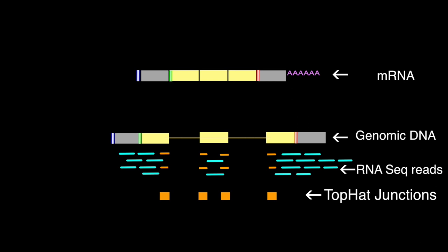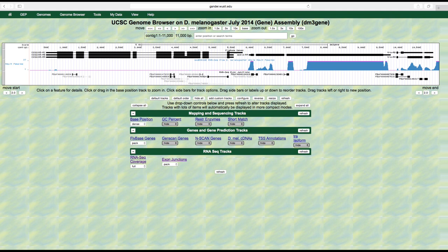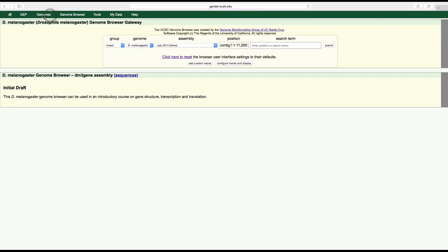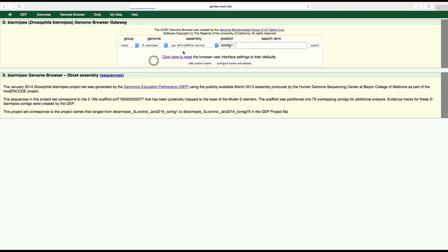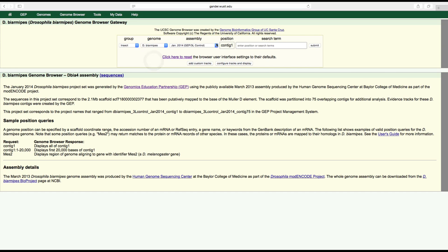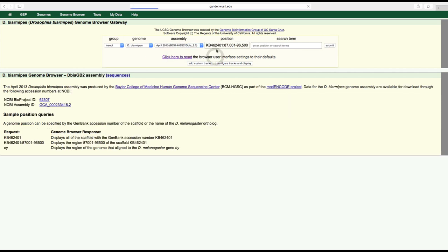Click on the genomes link on the main menu bar to return to the genome browser gateway page. Change the genome field to D. biarmipes, the assembly field to April 2013 BCM-HGSC Dbia_2.0, enter tra-pa into the search term field, and then click submit.